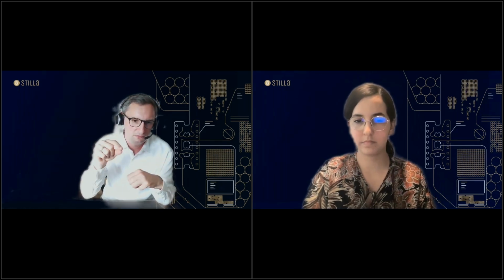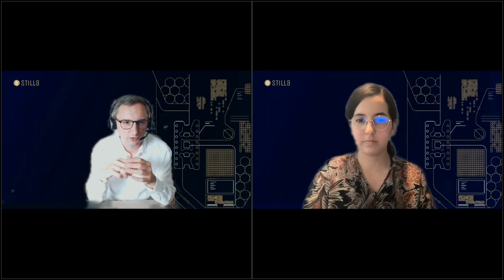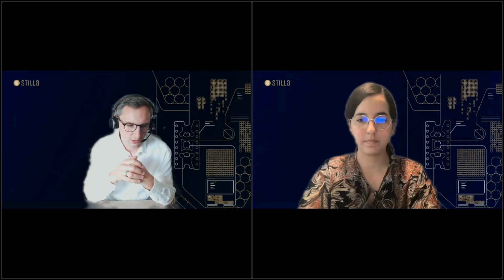And if you want to be on the safe side, there are two different ways. One way is you put an LNA on the position of the SNP and then another LNA on the base right next to it on each side, so that you basically have 3 LNAs flanking the SNP. The other way is that you put one LNA on the SNP and then you play with the other positions and see where it has the strongest effect on the melting temperature. So this is another possibility for how you can use it. You can use MGBs and you can use LNAs, not together, but there is no reason to use one and not the other. But in case of multiplexing, MGBs are not that good.